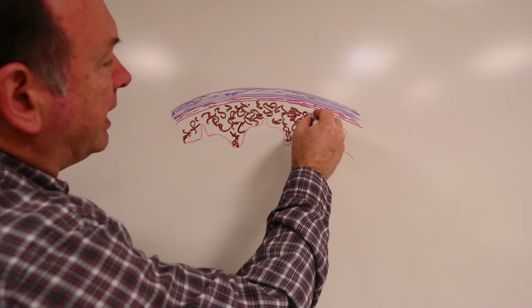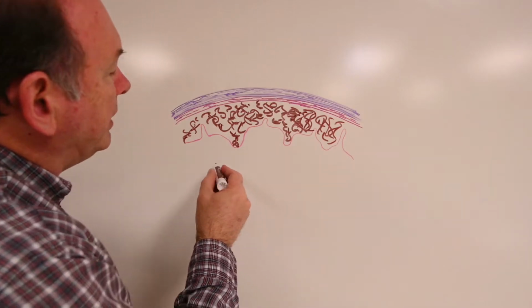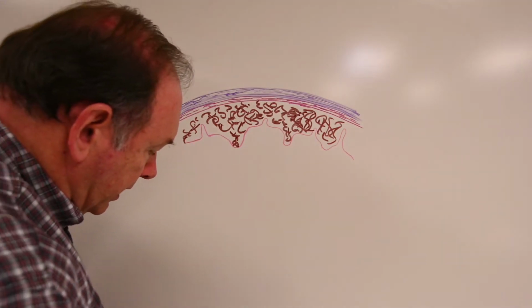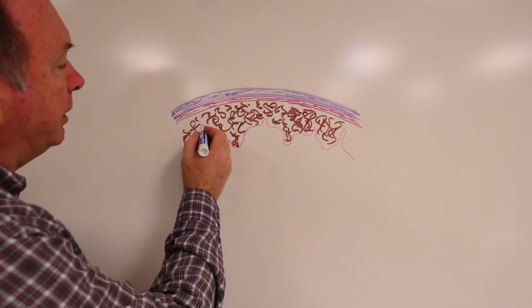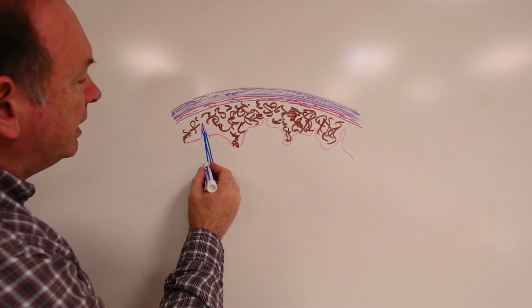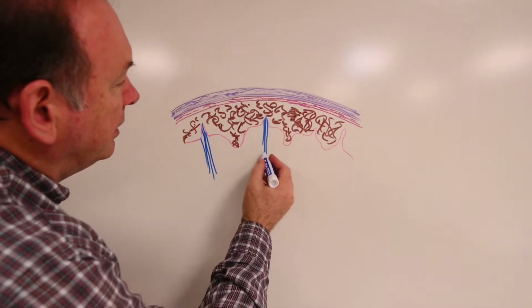And on the other side, away from the cortical labyrinths, we have what we call medullary rays. The medulla comes up into the cortex in some places where you see some of the straight tubules, the collecting ducts, extending even up into the cortical region.